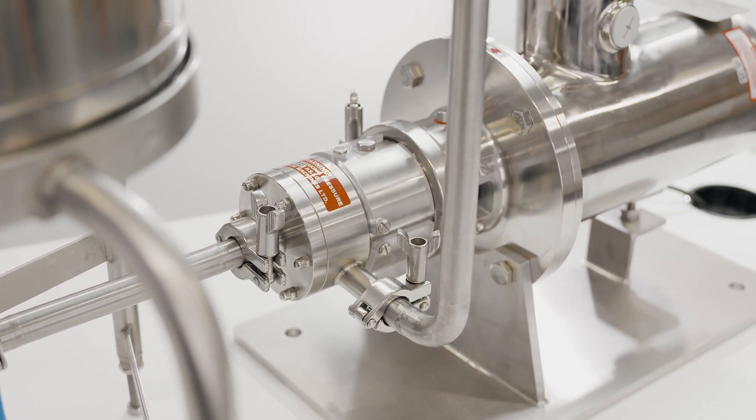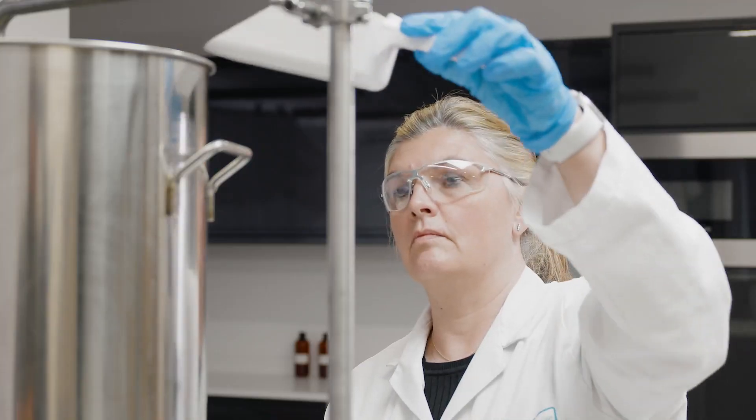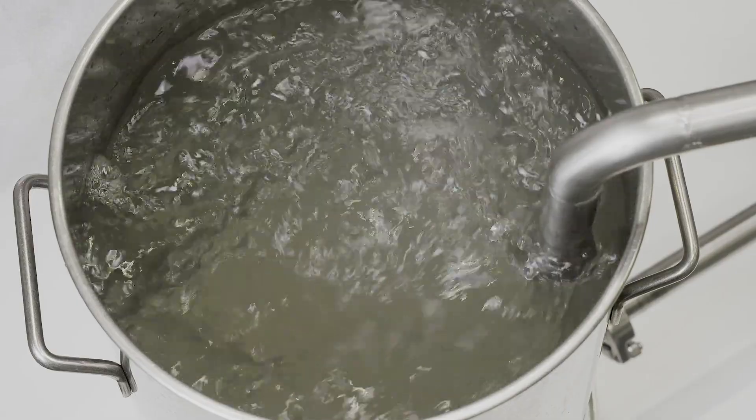This new model is ideal for batches of up to 50 liters depending on viscosity and is built to the same high specification as production-scale UHS mixers.